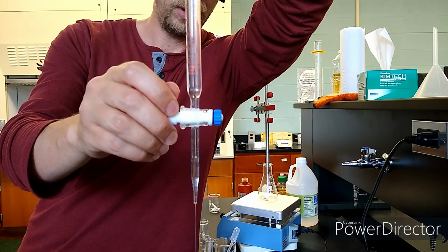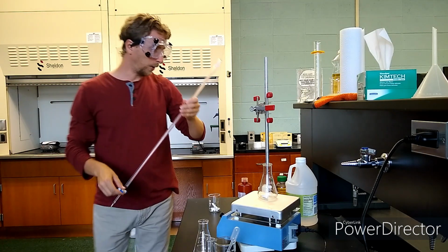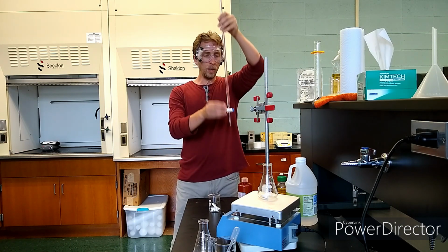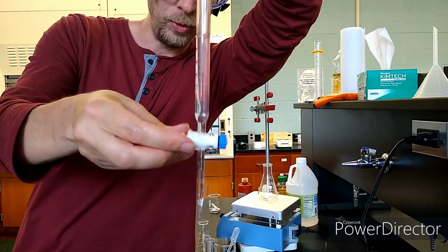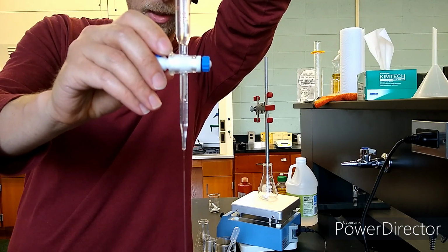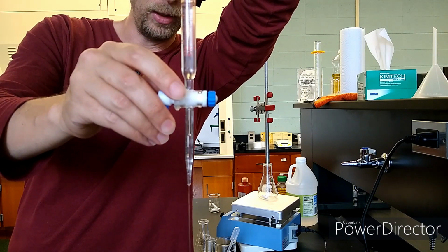Of course, now I'm going to go ahead and dump out most of the water. I like to check to make sure that it drains when it's full. When you dump out most of the liquid, though, the pressure is much less, and sometimes the stopper might not drain smoothly when it's down low on liquid. So I like to find that out and test that it's still draining smoothly at a low liquid level. And it looks like it's still draining just fine.